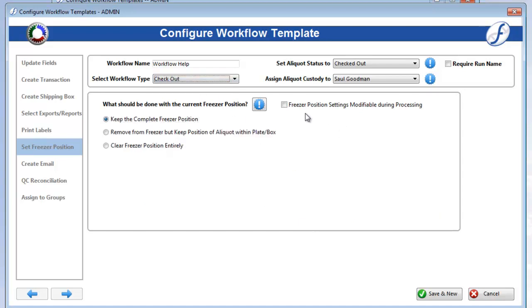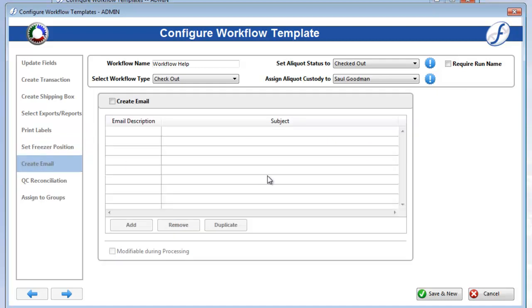Remember that if you want users to be able to modify this page when processing, check on Freezer Position Settings Modifiable During Processing.